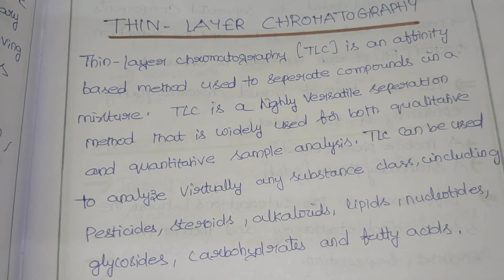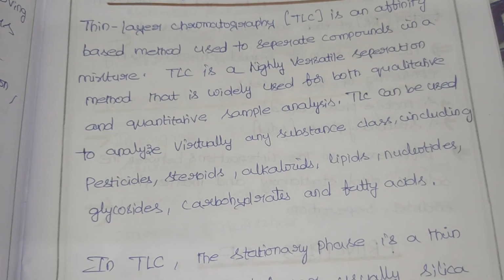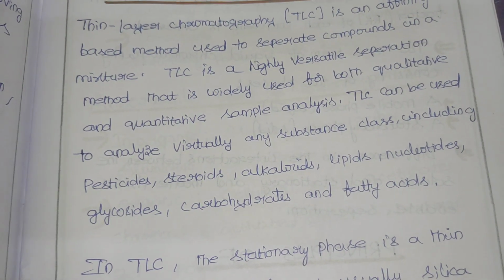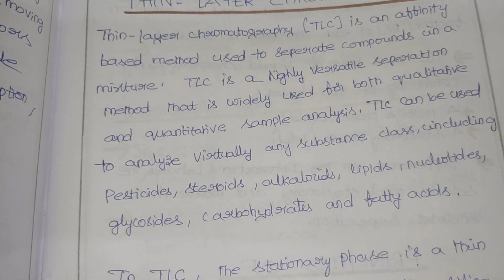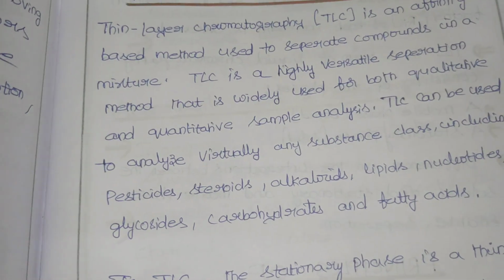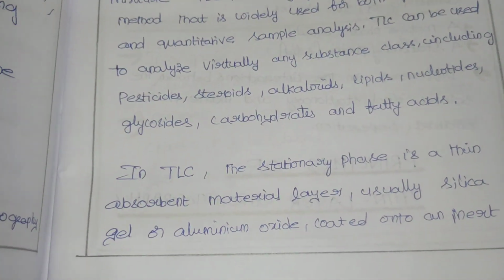It can be used to analyze virtually any substance class, including pesticides, steroids, alkaloids, lipids, nucleotides, glycosides, carbohydrates, fatty acids, to separate the different components in all of these. This thin layer chromatography is used, in short form TLC.